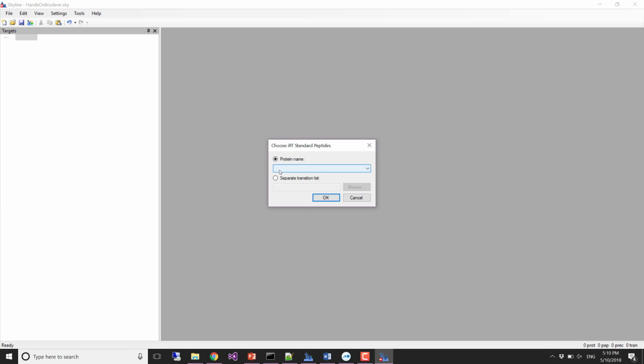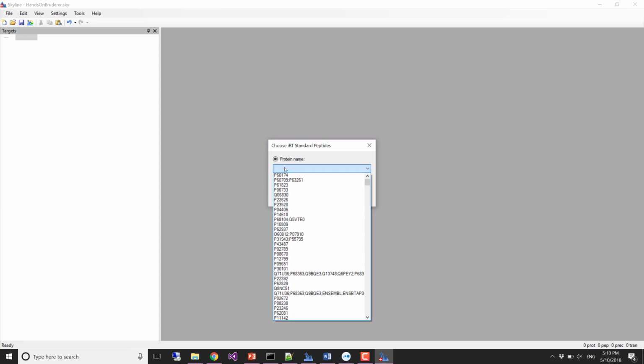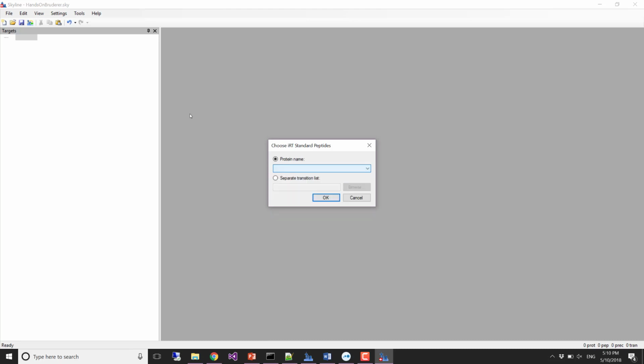Okay, especially if you don't select the water losses, it turns out there's a lot of loss ions in this thing. Okay, so now Skyline knows this is an assay library, but it says, I don't see your iRT standards, so can you tell me where they are? One way would be that the assay library itself might contain a protein. So sometimes you'll see right at the top of this list iRT, and then you just choose that.